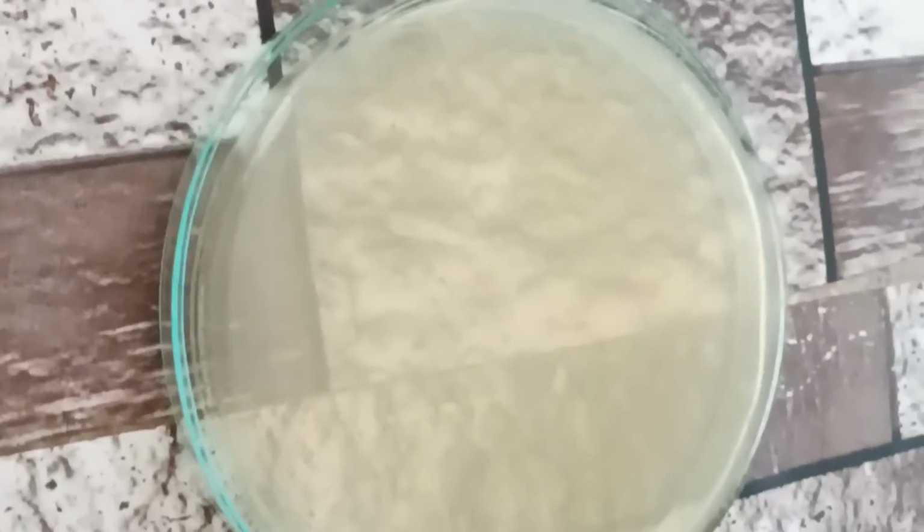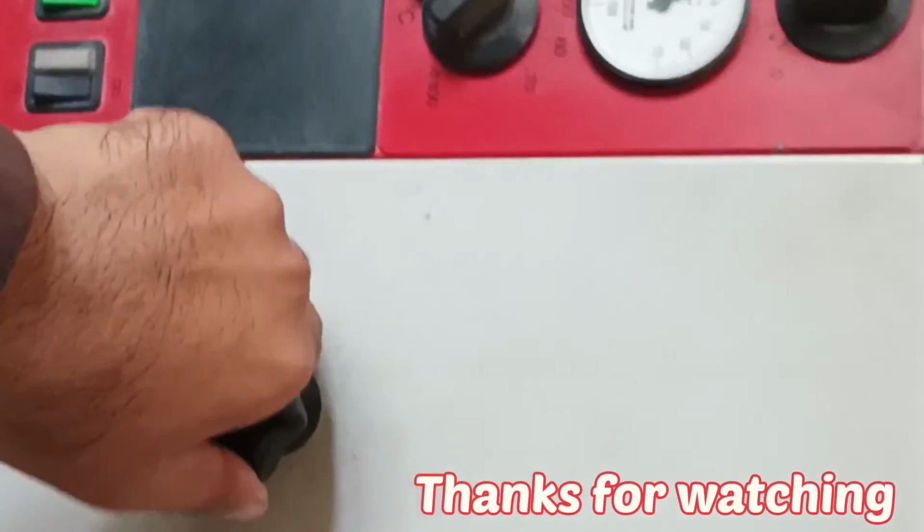Now the media has cooled down and it is in solidified form. This solid form of the media is called agar, and it is now ready for bacterial inoculation or culture. Now we place this media in the incubator. And this media is ready for bacterial inoculation.